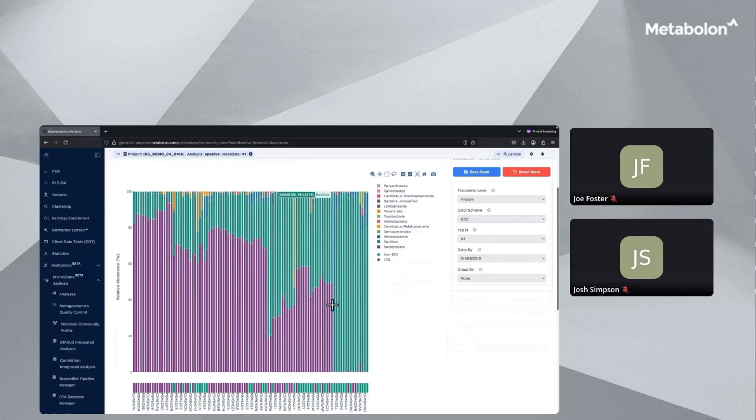However, removing group separation causes the samples to be reorganized based on similarity of microbial profile alone. This enables us to explore whether certain study variables, like diagnosis, contribute to distinct sample clustering. These variables can be viewed according to the colors on the bottom. In this case, we again see that many IBD individuals have Bacteroides-dominant microbial profiles, and we also see that a subset of non-IBD individuals are lacking the taxa altogether. These are likely the non-IBD samples that diverge from the IBD samples the most dramatically in that beta diversity screen earlier.